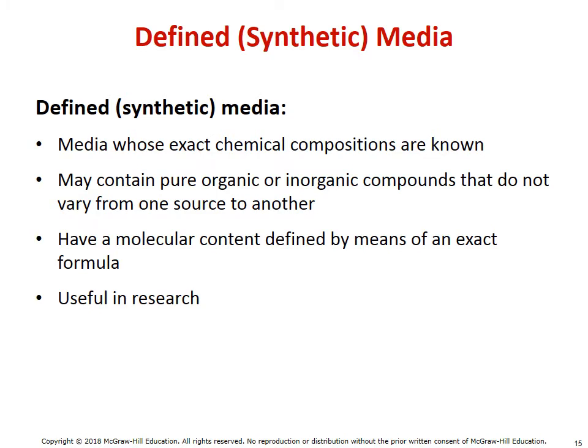So let's talk about defined or synthetic medias. These medias are designed with a very specific chemical composition. They are man-made to be used for a very unique purpose. They'll typically contain very pure organic or inorganic compounds that do not vary. The idea here is we're trying to be very precise in what we do, so we're really trying to control the environment, which naturally would be very useful in research.